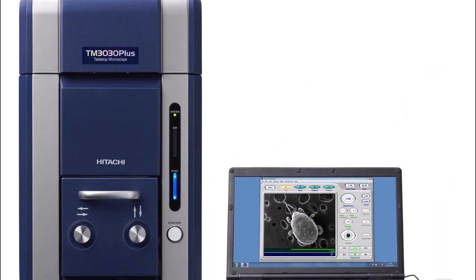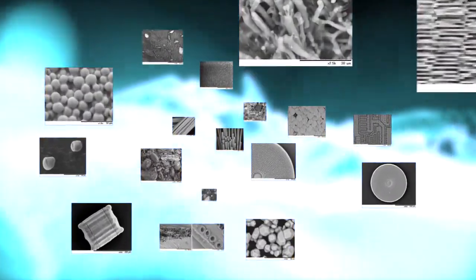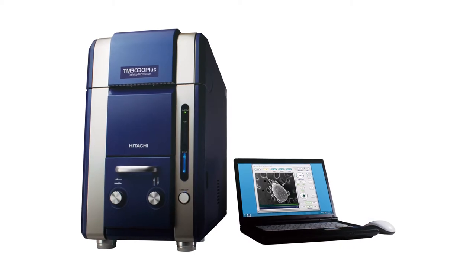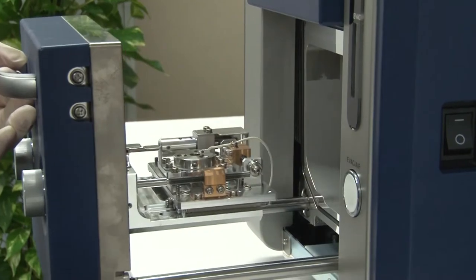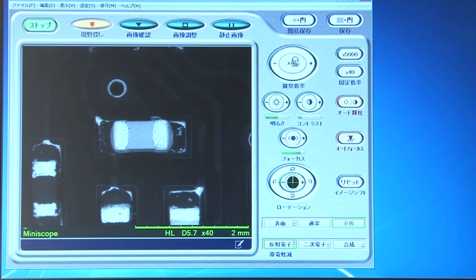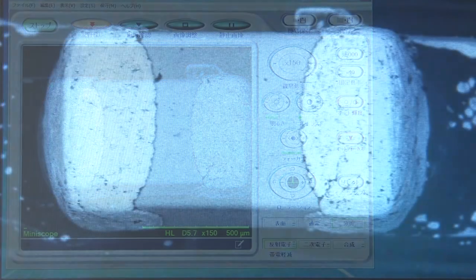Hitachi High Technologies has developed the TM3030 Plus, a tabletop electron microscope that enables anyone to observe and analyze samples without preprocessing, even if the samples are non-conductive or contain water. It's compact, just 33 cm wide, 60.6 cm from front to back, and 56.5 cm high. It also comes equipped as standard with features used in high-end models, namely a semiconductor-type back-scattered electron detector and a low-vacuum secondary electron detector, which was newly developed by the company.